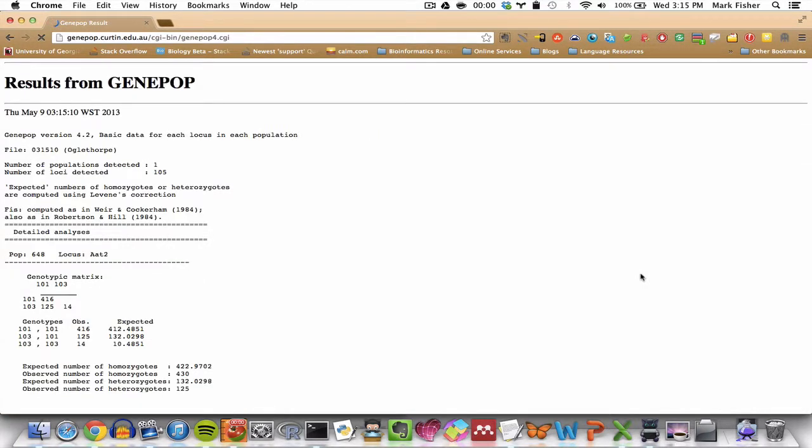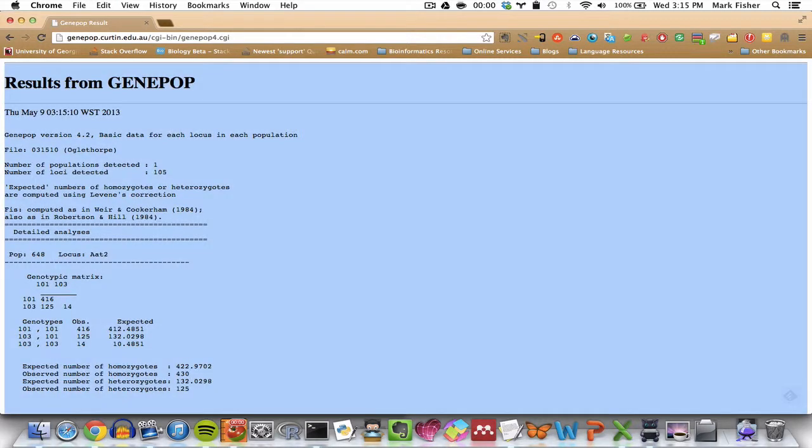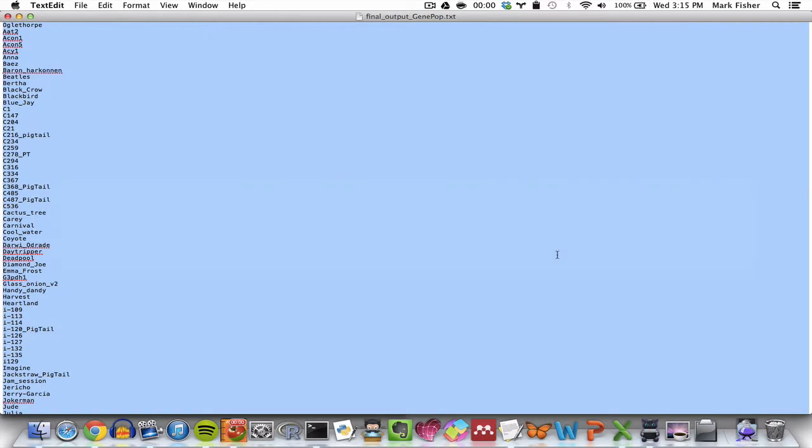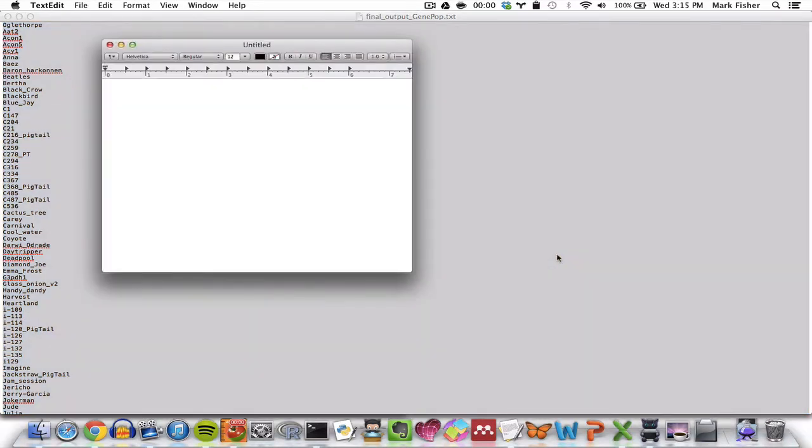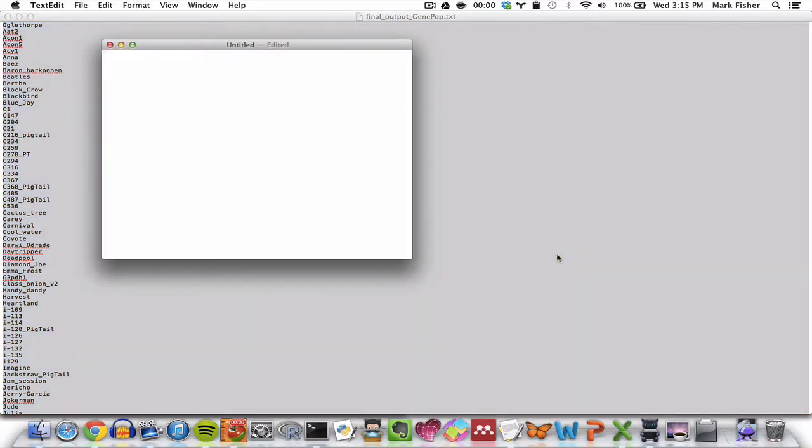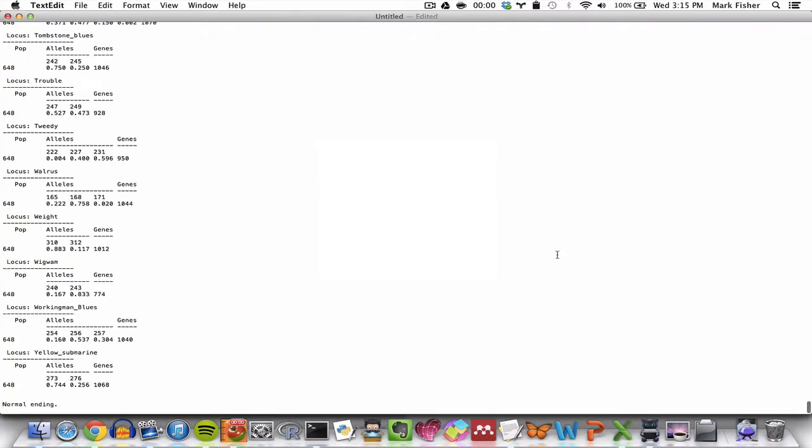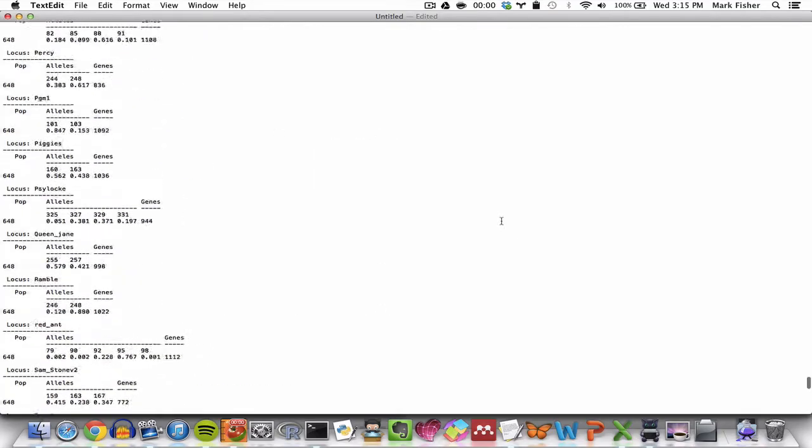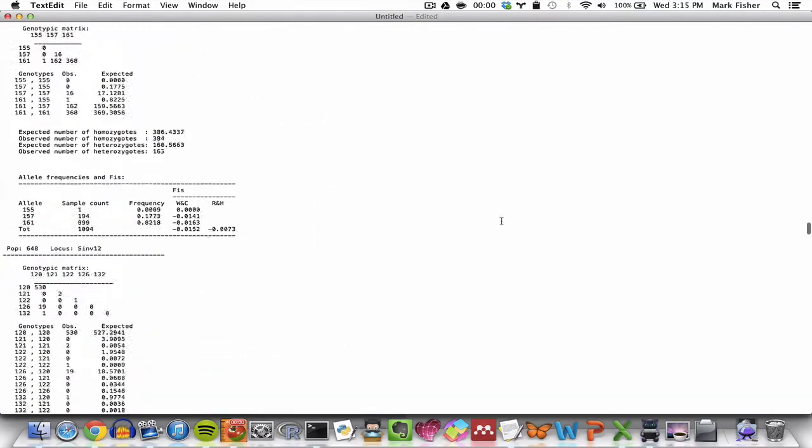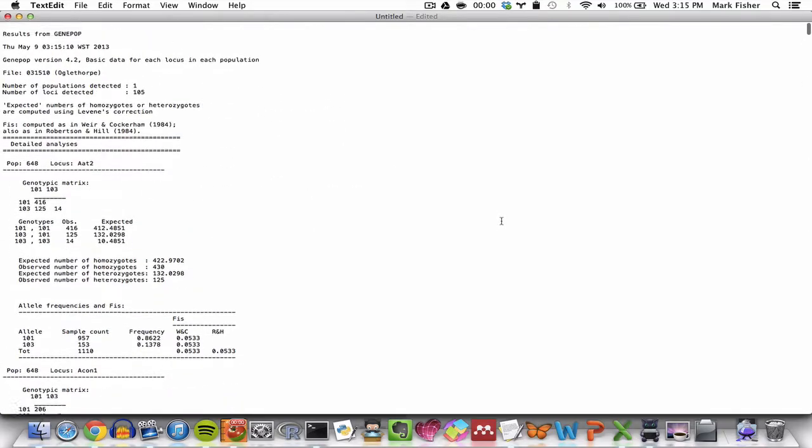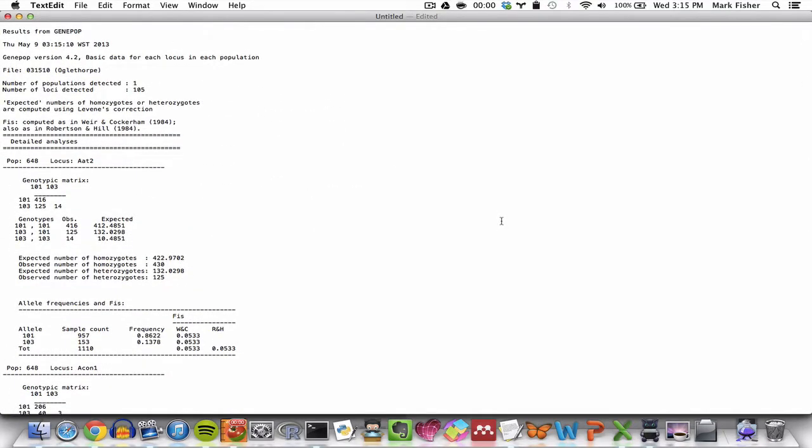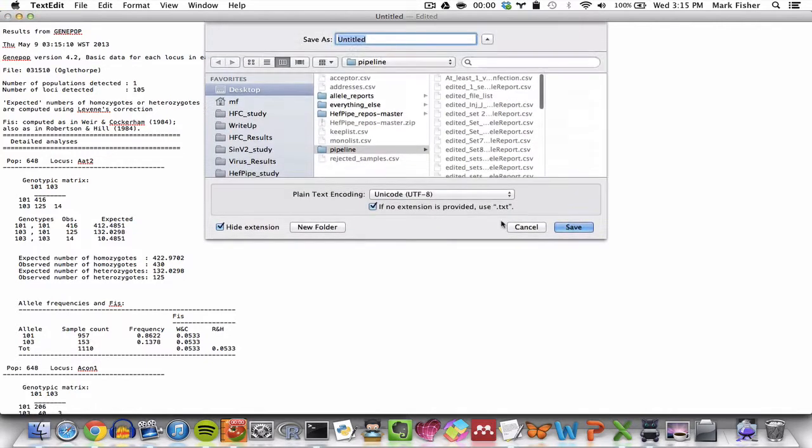And when the output file is generated, we have to copy it from the browser into a plain text file. So here I'm copying it from the browser. I open a new plain text file and paste. And then I save that text file, which in our example, let's call it opt5, in the pipeline directory. So it's already being saved to the pipeline directory. Click Save.